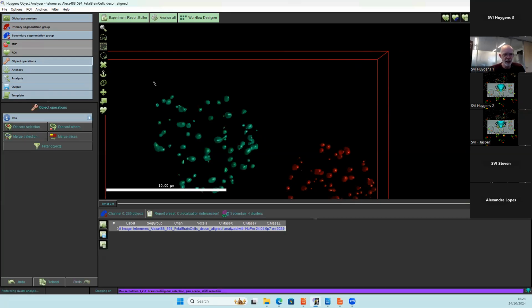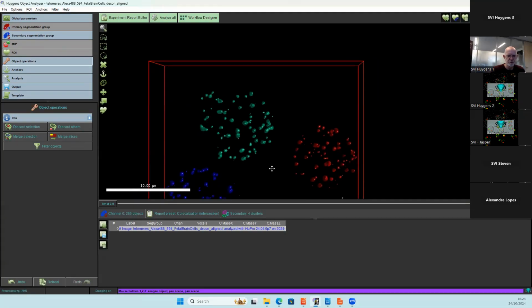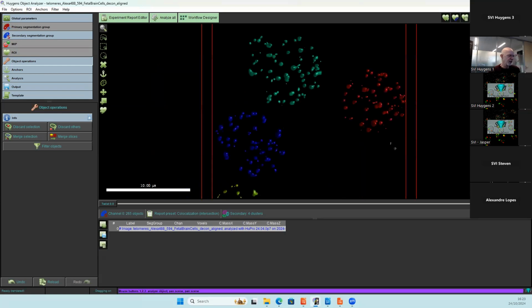Okay, if we click again on the scene, then the selection, the lasso, is also removed, and we click on the magnifying glass just to inactivate that selection tool. We can center the image with the square button here at the complete right of the twist slider, just below the scene on the right, to center the image.